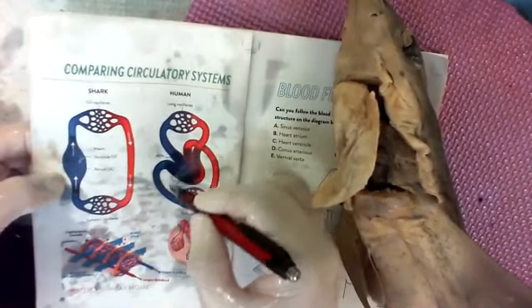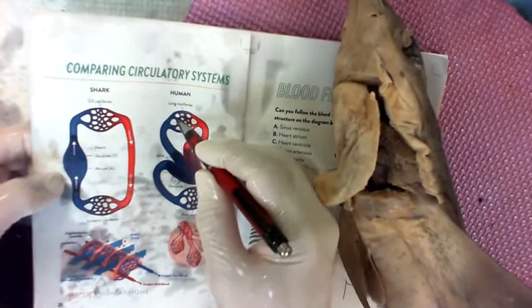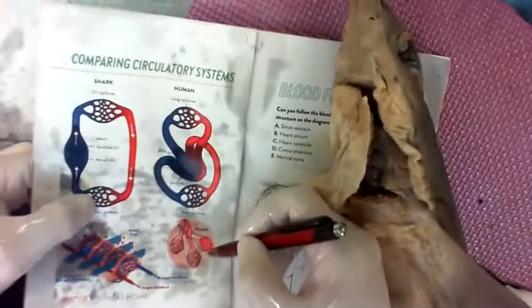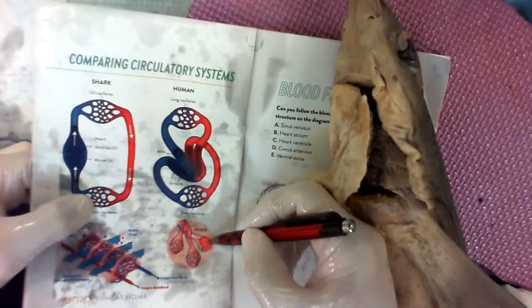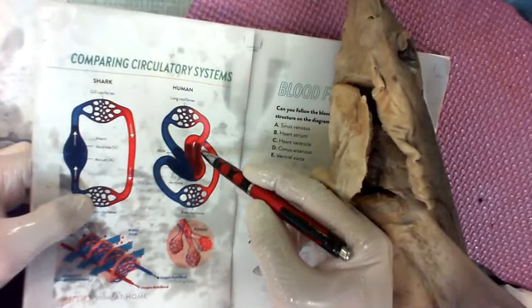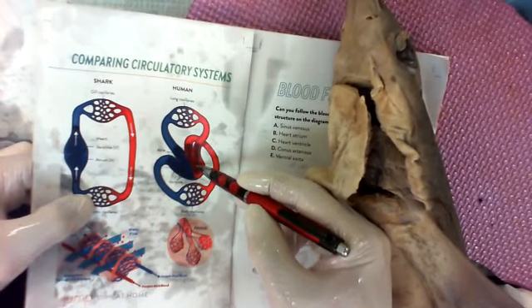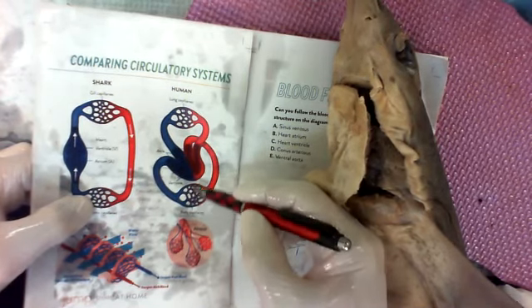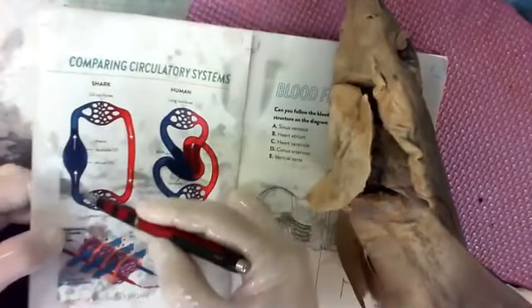Atria, ventricle. The ventricle squeezes hard. The atria closes a door so that the blood can't fly backwards, and then the blood squirts up, goes into the lungs, picks up oxygen. So we breathe in oxygen, we hold our breath, like I said, for a portion of a second. The oxygen jumps into these blood vessels, turning the blue blood, quote unquote, into red blood. The bright red blood circulates back to your heart on the other side, into the atria, down through the door to the ventricle, and then the ventricle squeezes hard and pushes it out to the rest of the body. Back to the muscle, gives it some more oxygen so you can do another curl, back up. 2 atria, 2 ventricles.